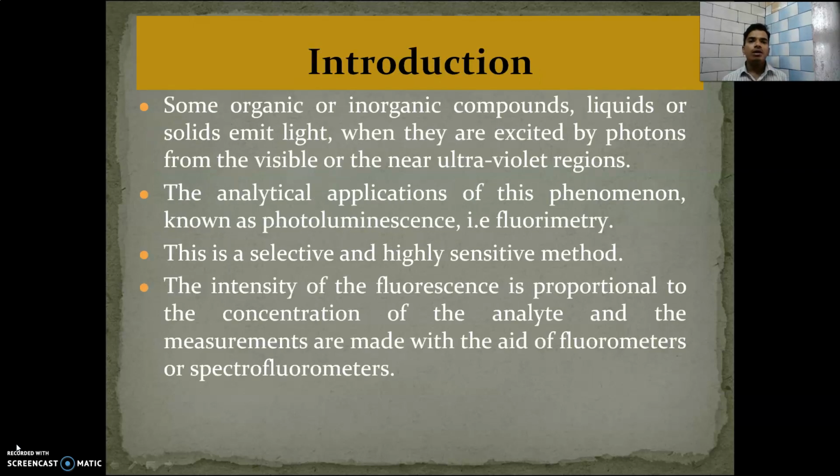So the first point is the introduction about this method. Some organic or inorganic compounds, liquids or solids emit light when they are excited by photons from the visible or near ultraviolet region. The analytical application of this phenomenon, photoluminescence, is nothing but fluorimetry.